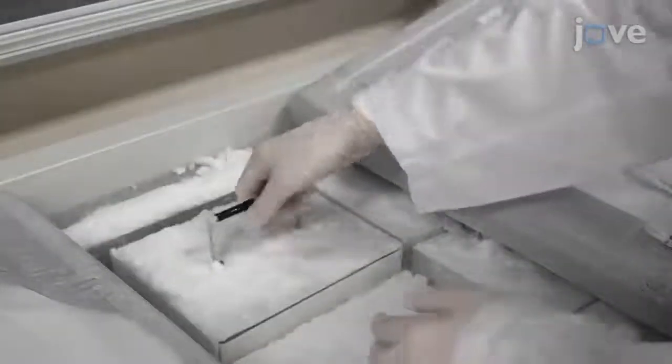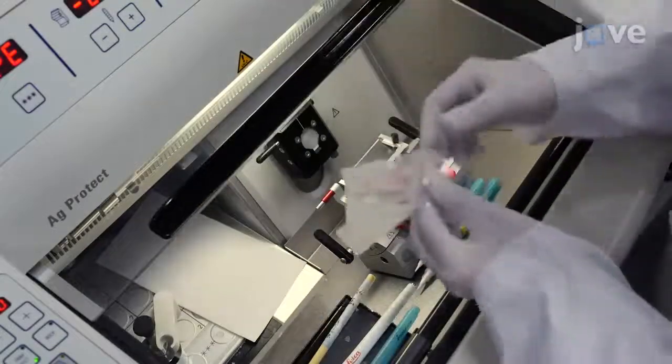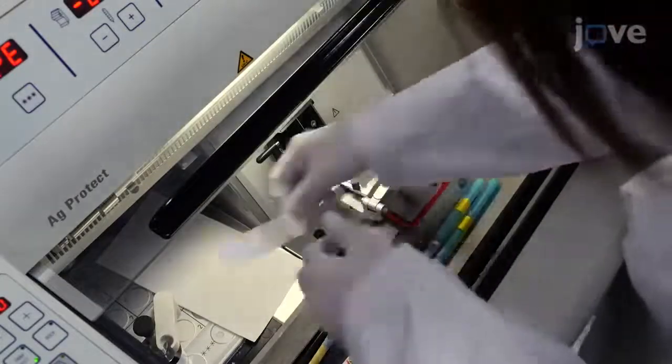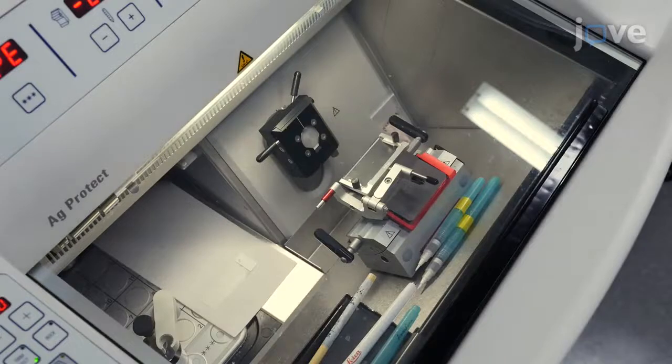To cut the tissue sections on a cryostat, first place conductive indium tin oxide, or ITO, coated microscope glass slides inside the cryostat. Warm the autopsy brain specimen from -80 degrees Celsius to -22 degrees Celsius inside the cryostat.